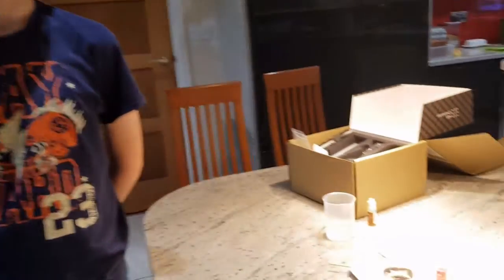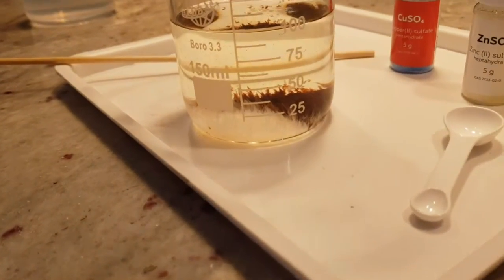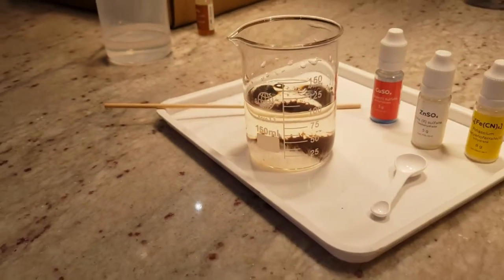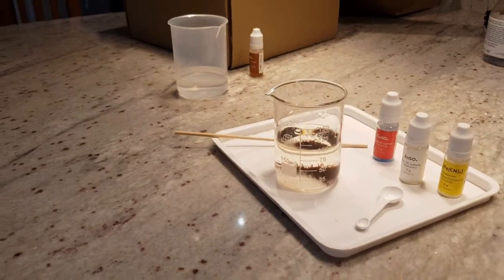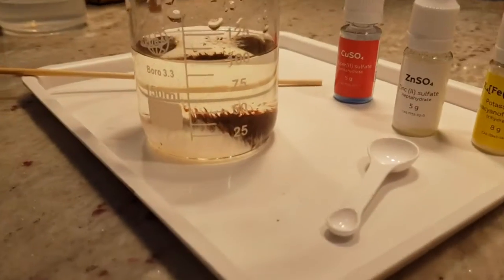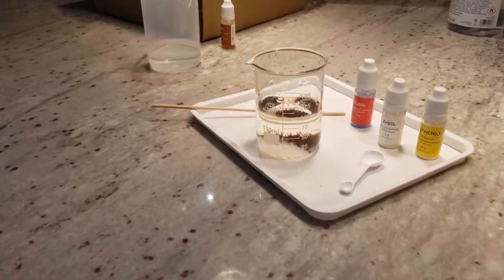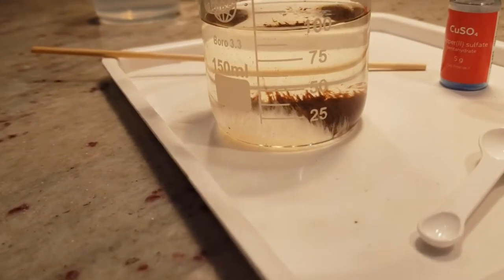the metal salts gradually dissolve and react with the potassium hexacyanoferrate. This creates insoluble copper and zinc compounds. The reason why it doesn't precipitate out is because it forms a bubble around them, and the chemical seaweed grows from these bubbles. And you can clearly see it is growing. We're now going to leave it for 20 to 30 minutes.